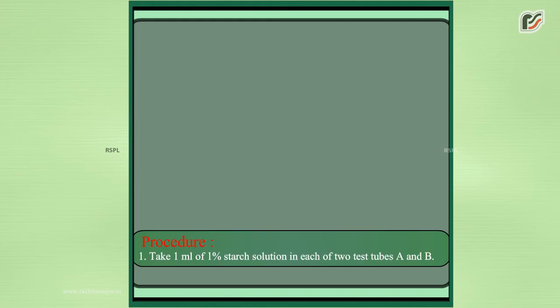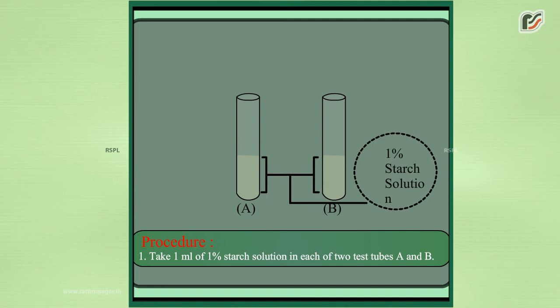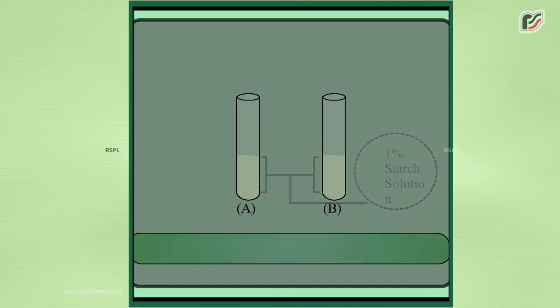Procedure: 1. Take 1 ml of 1% starch solution in each of 2 test tubes A and B.